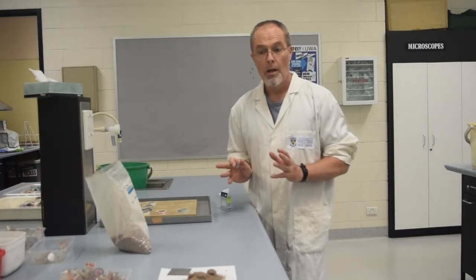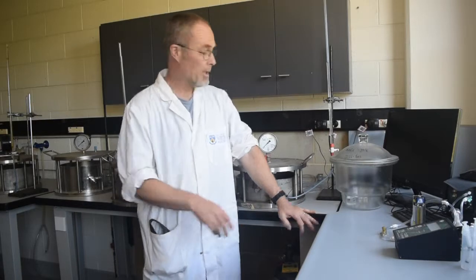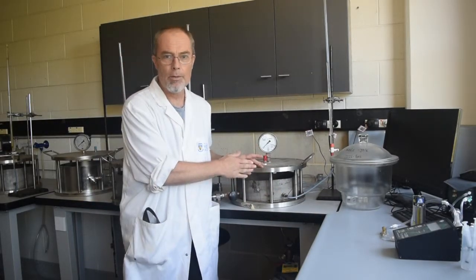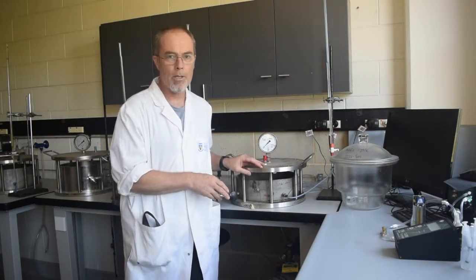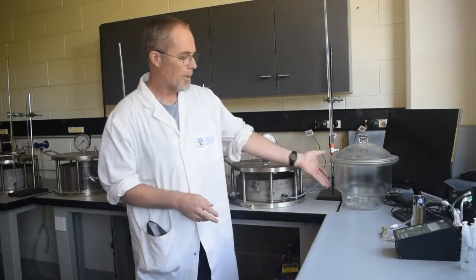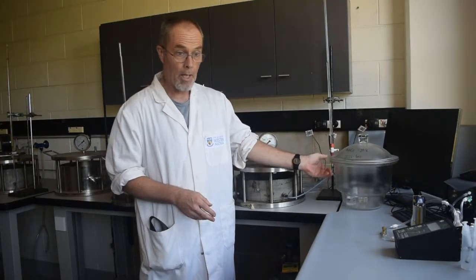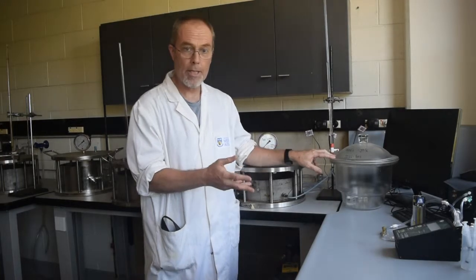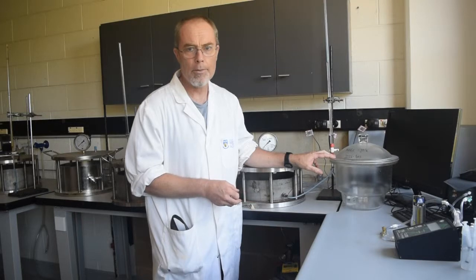We apply the pressure to the soil samples in these very thick-walled steel vessels here, and we can apply pressure up to about 1500 kilopascals. Above that we have to cheat a little bit and apply pressure chemically. We keep saturated solutions of different salts in a sealed desiccator, and that saturated solution is able to absorb water from the atmosphere inside to create an equivalent pressure up into the megapascal range, so we can get soils quite dry doing this.